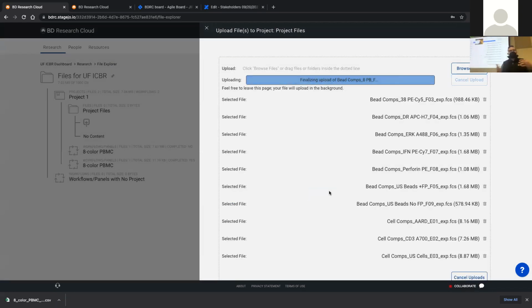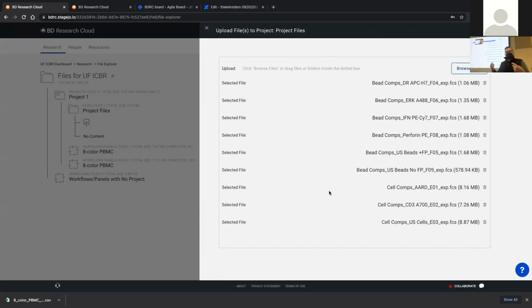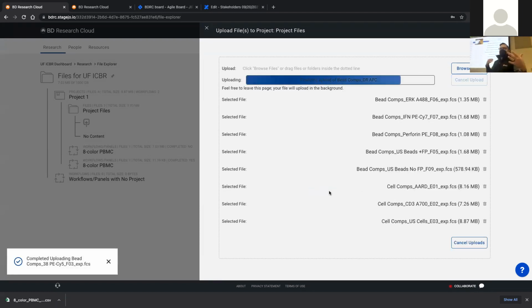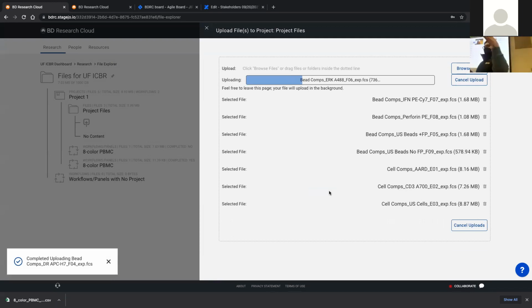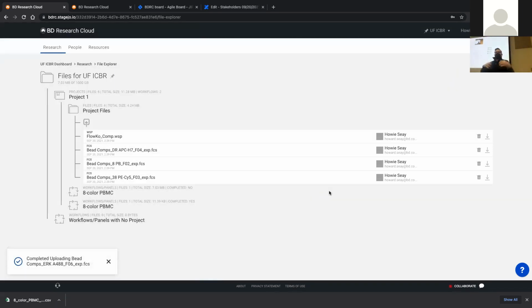So this project has been ongoing for a little over a couple of years. We want to start automating some of these processes. It would be great if, let's say, you could upload a bunch of files and they would run FlowJo AI, which Christian introduced earlier to the group. And then you knew that all of the samples had been QC'd and should be analyzed, right? If you have some predefined gating and want to apply that, we're working on those types of things now.